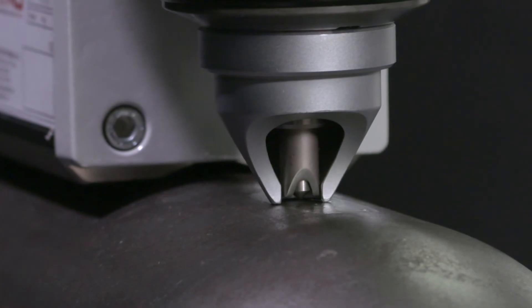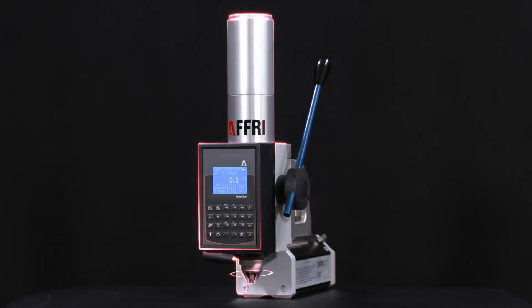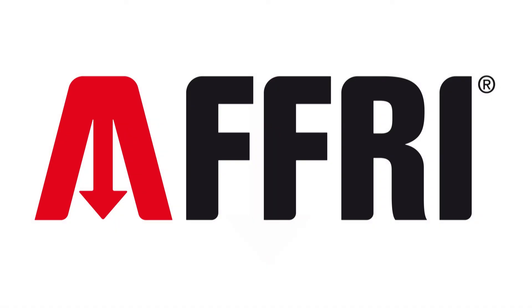The rapidity, repeatability and test speed of AFRI systems make them the gold standard in hardness testing.